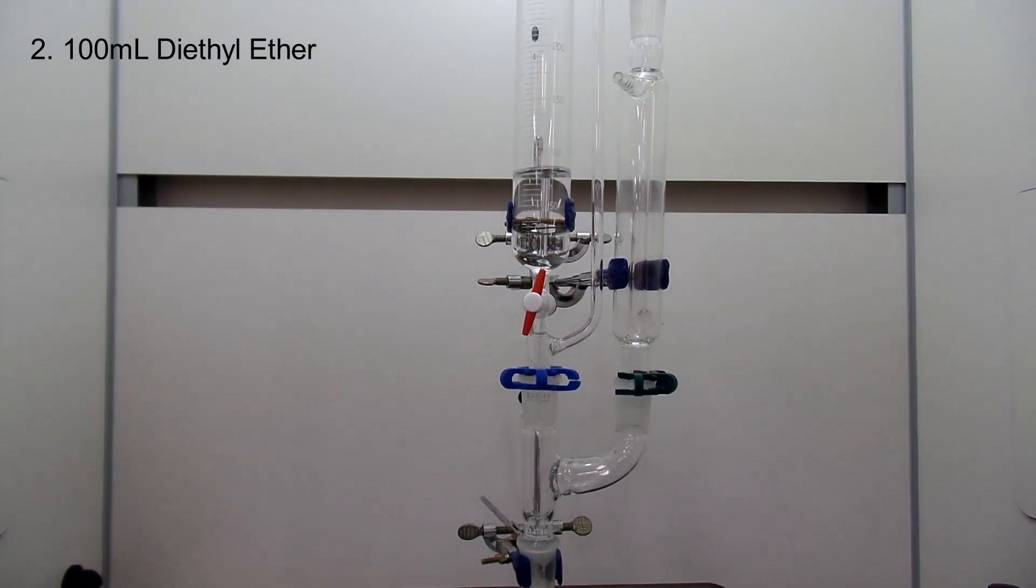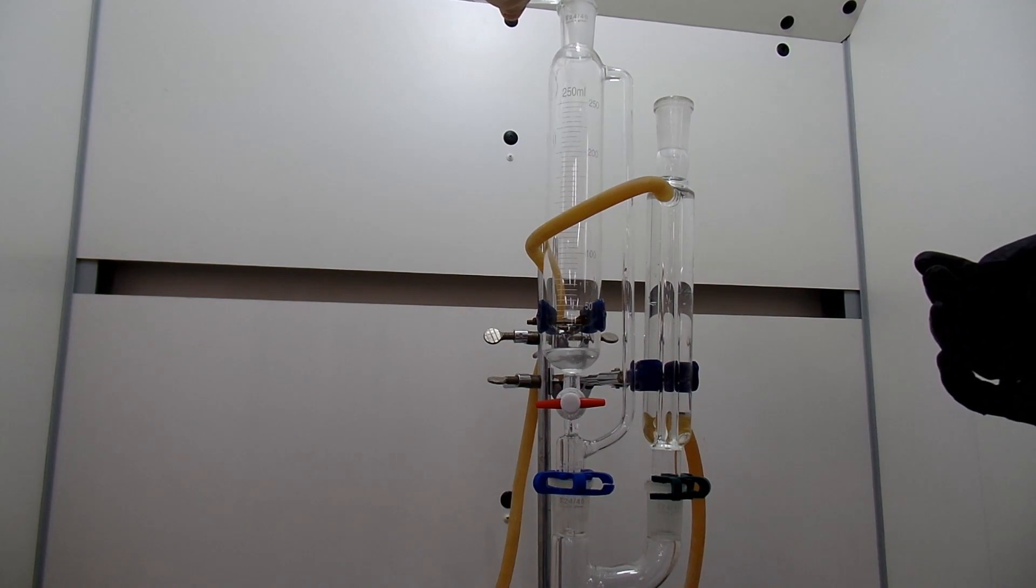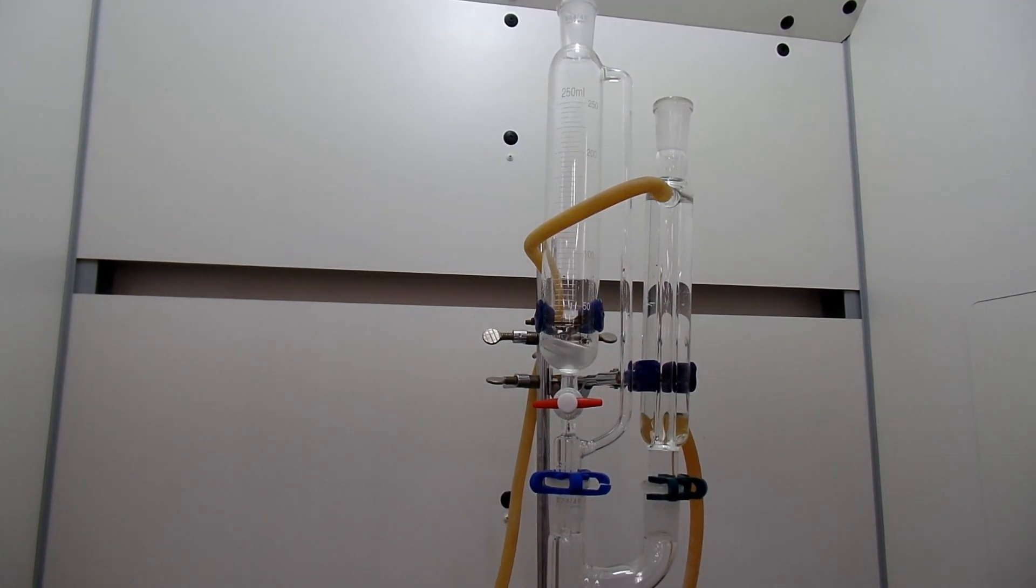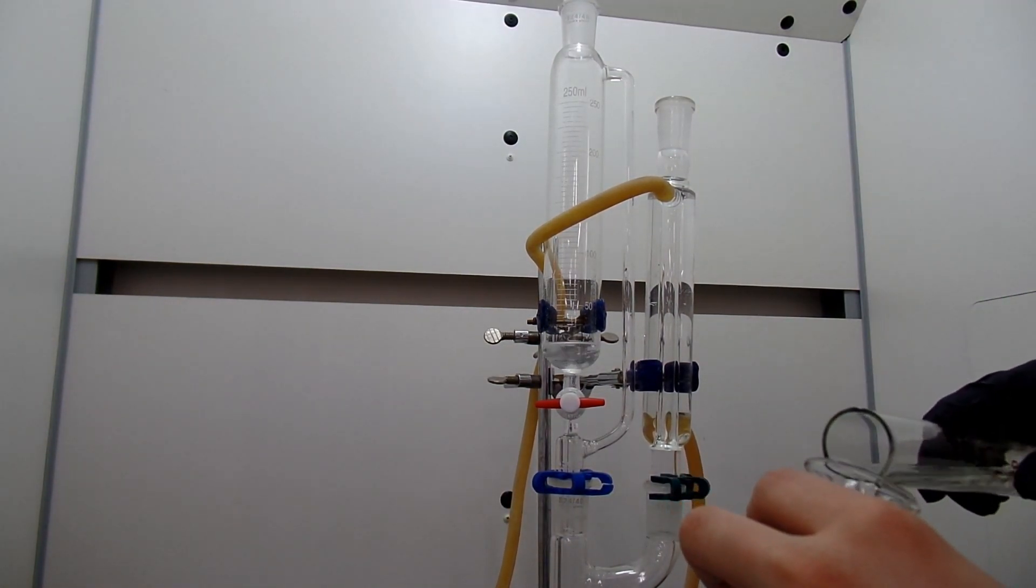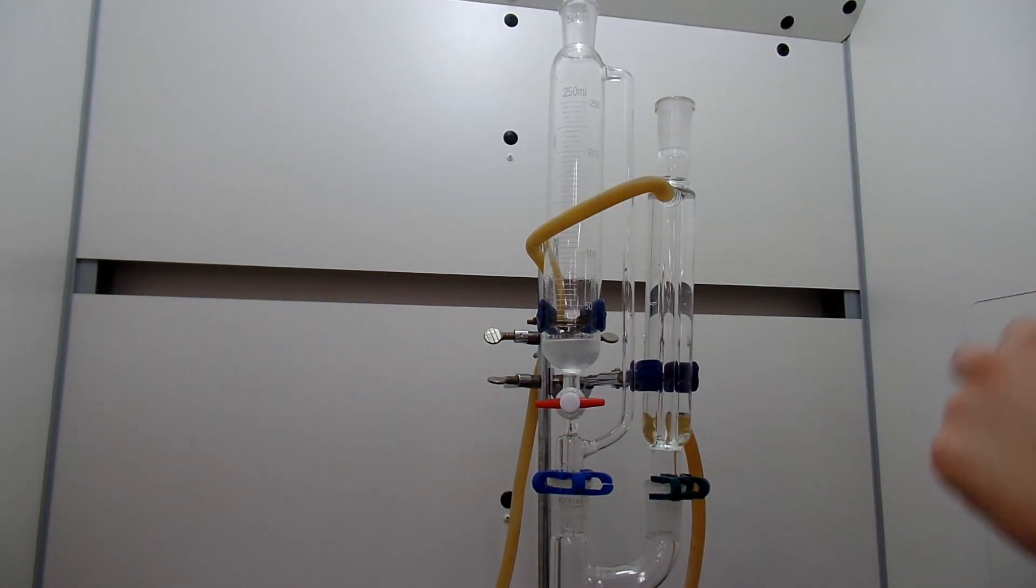So with everything ready, I add 100 ml of diethyl ether into the flask. Second, I add all my 1-bromopropane and 15 ml of diethyl ether into addition funnel. I didn't use the funnel to add 1-bromopropane and some of it got through the pressure equalizing port.